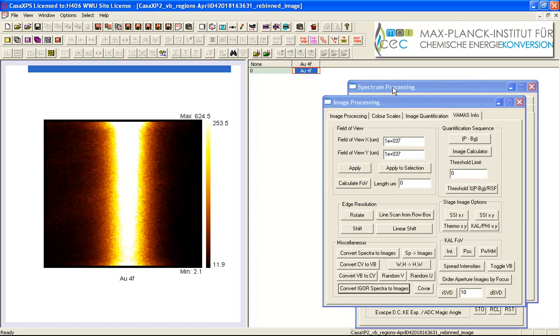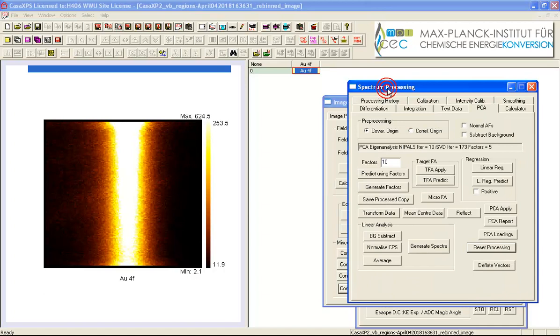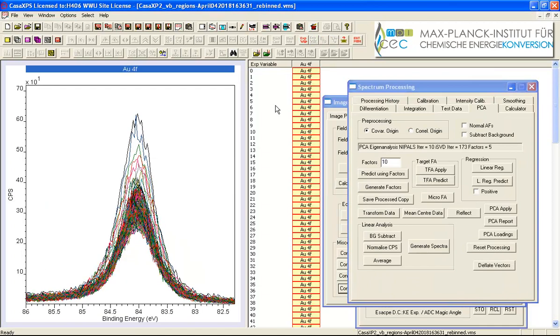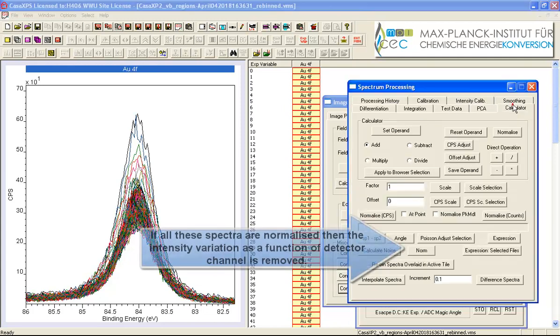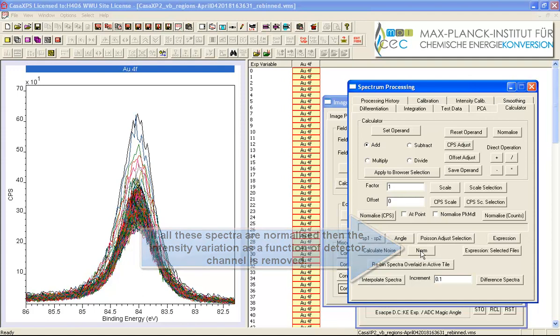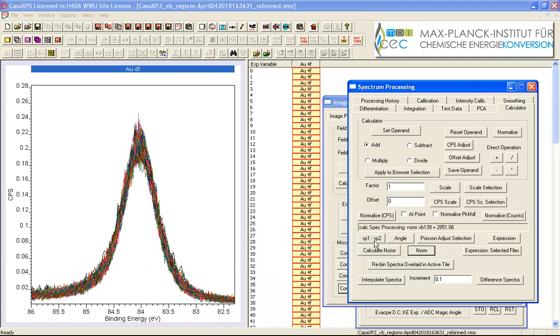So let's just do one more operation. Let's close that one and back to these rebind data. On the calculator property page there's a button that will act on all of these data in the active tile and normalize the data.